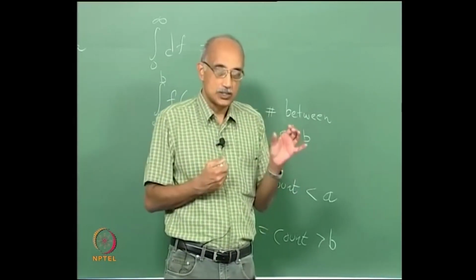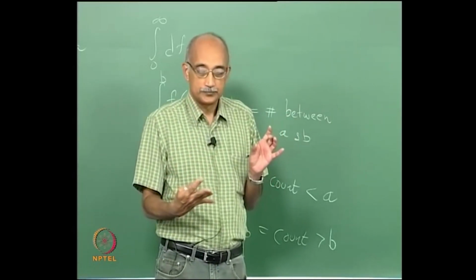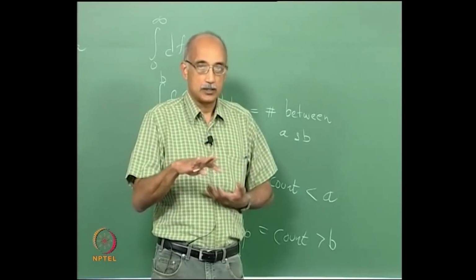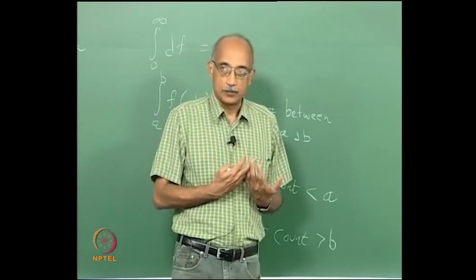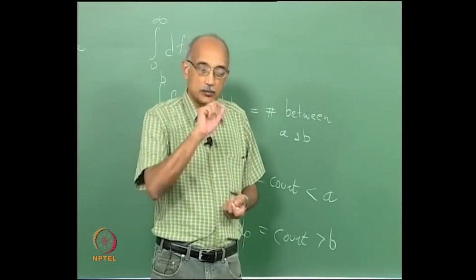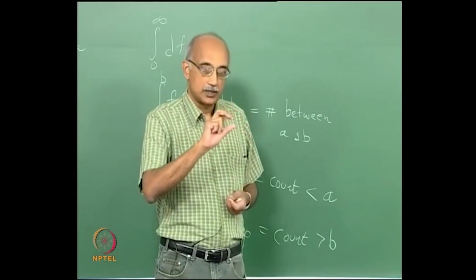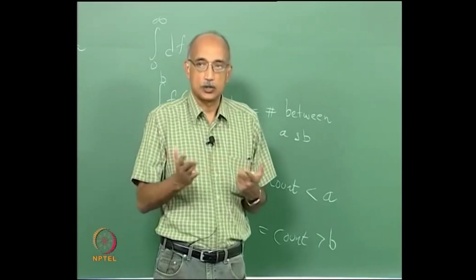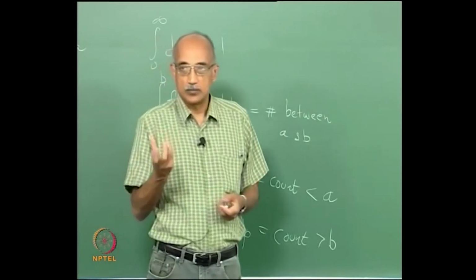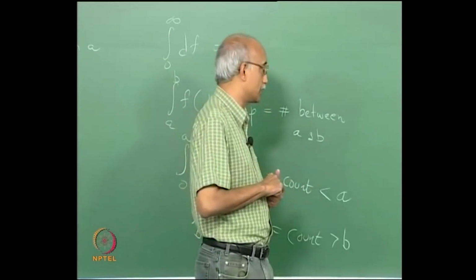So, you want to get as concentrated a suspension as possible in order to improve the statistical accuracy of your analysis, but you want to keep the concentration lower than the limit at which coincidence errors start happening. Basically what would happen is, if you have too many particles that are too close together, instead of single particles being detected by the laser, you may have multiple particles that are essentially screening each other, and that is called a coincidence error, and that leads to a significant reduction in the efficiency with which particle counts are obtained in a light scattering type of particle counter. So, you have to balance that very carefully.